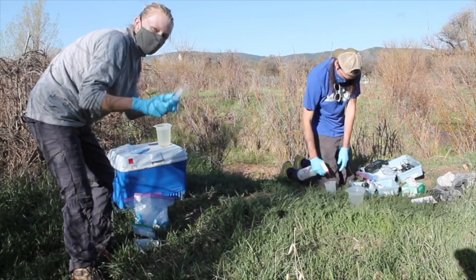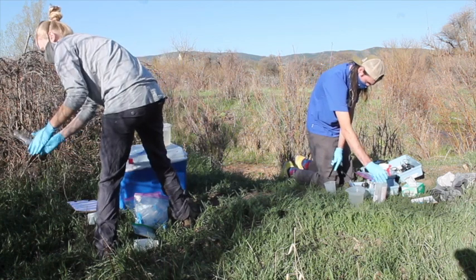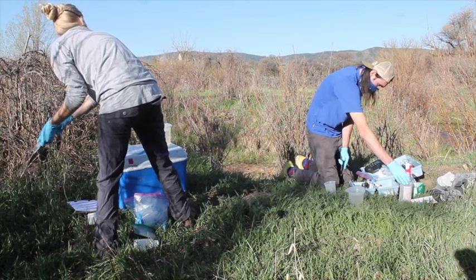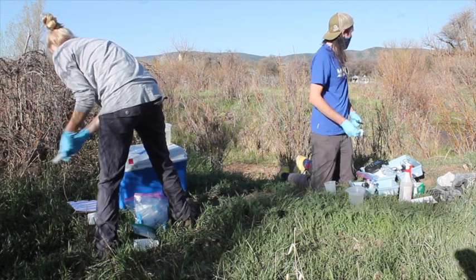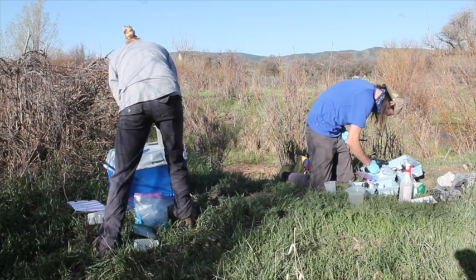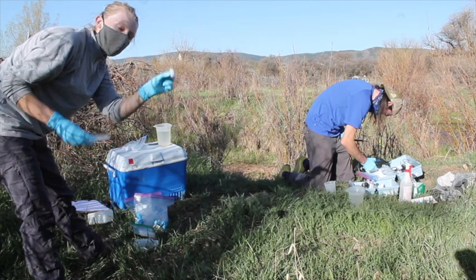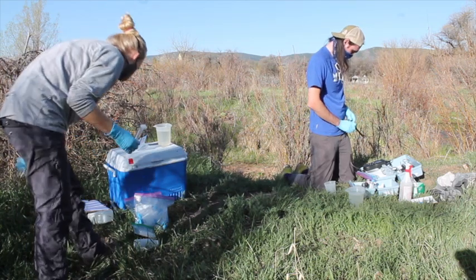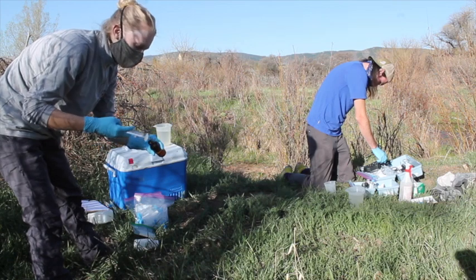I'm going to take the syringe and just rinse it out a couple times. Then I'll take this 0.45 micron filter and first squeeze a little water out of it to flush out the filter, then go ahead and fill up this amber vial.